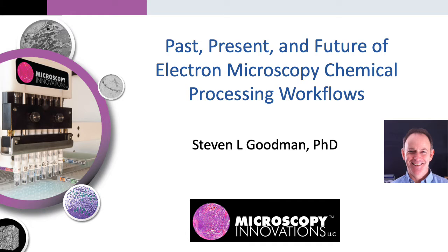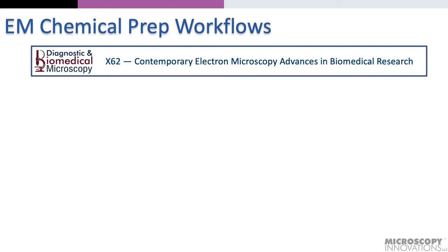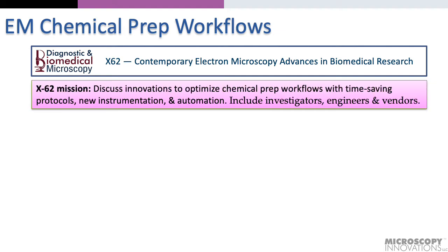Chemical preparation is the backbone method for biomedical electron microscopy. This presentation was prepared for the vendor symposium session and for this pre-meeting workshop, now postponed. The goal of this workshop was to discuss innovations to improve chemical prep workflows. I was asked to provide my perspective as a vendor, which I will do in this brief presentation today.